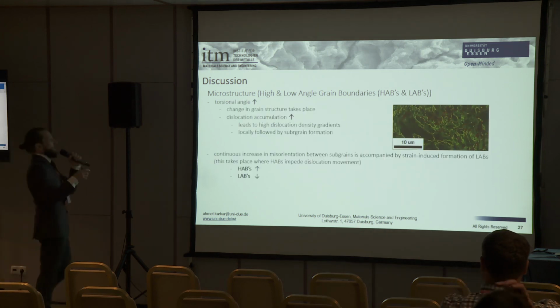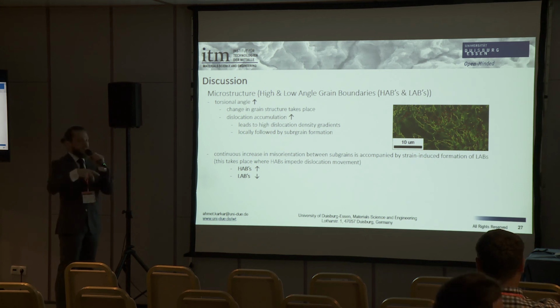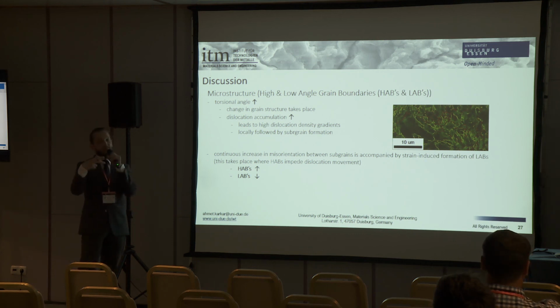Finally, I want to say that with higher torsional angle, it becomes clear that the amount of high angle grain boundaries increases, and that as we assumed, like in laser shock peening after multi-axial fatigue, some nearly dynamic recrystallization processes take place on the surface of the specimen.